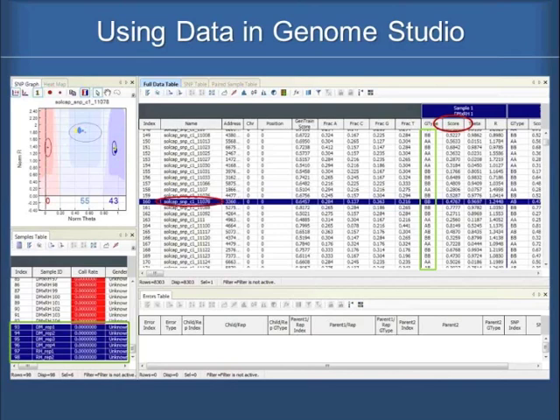And so what you can do now is say, I want to look at the parents, or I want to look at one of the progeny or multiple progeny. You can highlight them here, choose the color, and then look up here and see what you see. So the ones in yellow here are the ones that are highlighted. So these are the parents. The DM, we have 4 reps of that, and the RH, we have 2 reps. You can see them highlighted in yellow. So you can choose the colors and all this. It's a pretty nice program.